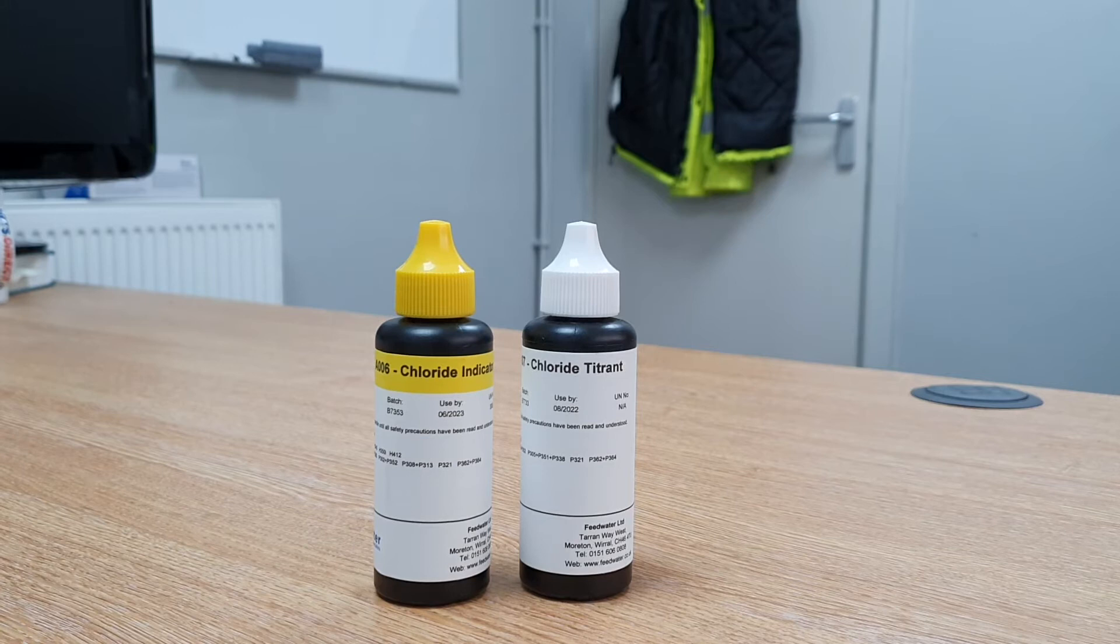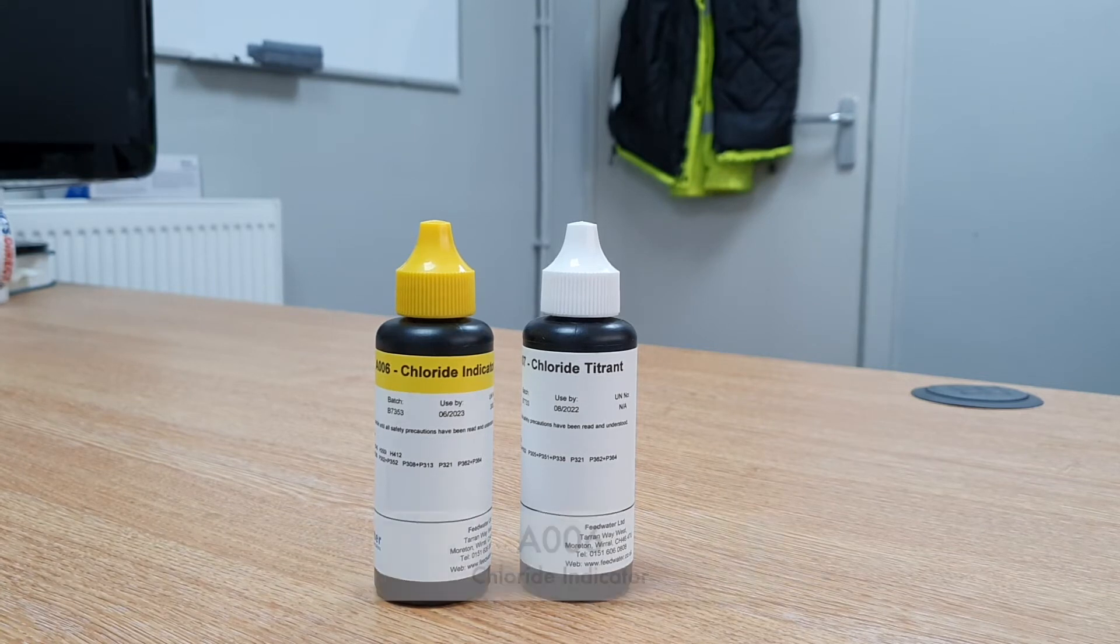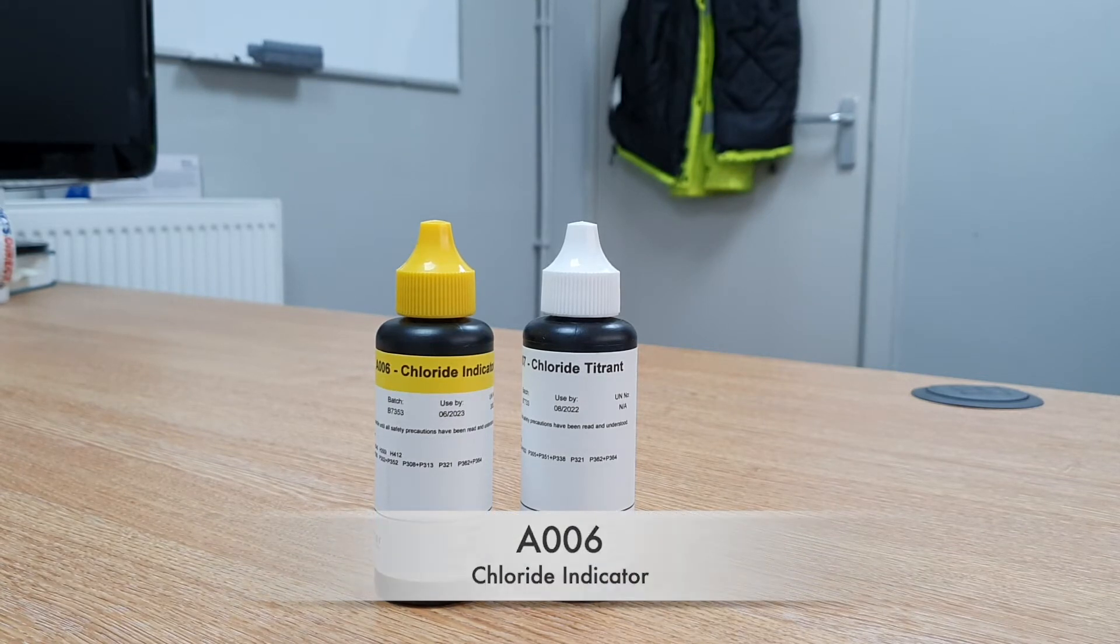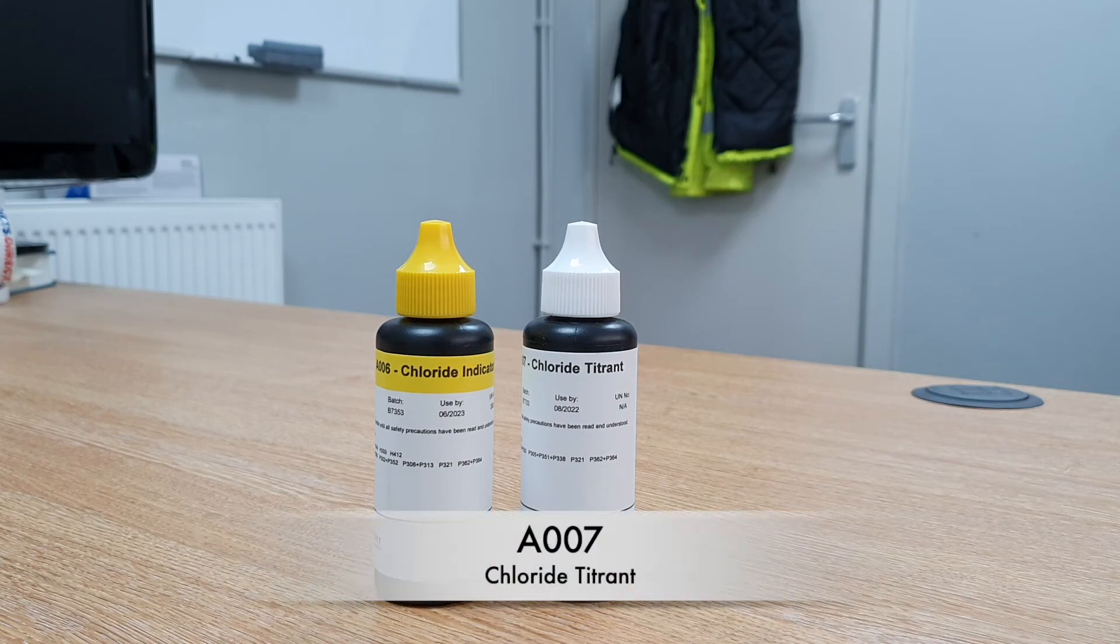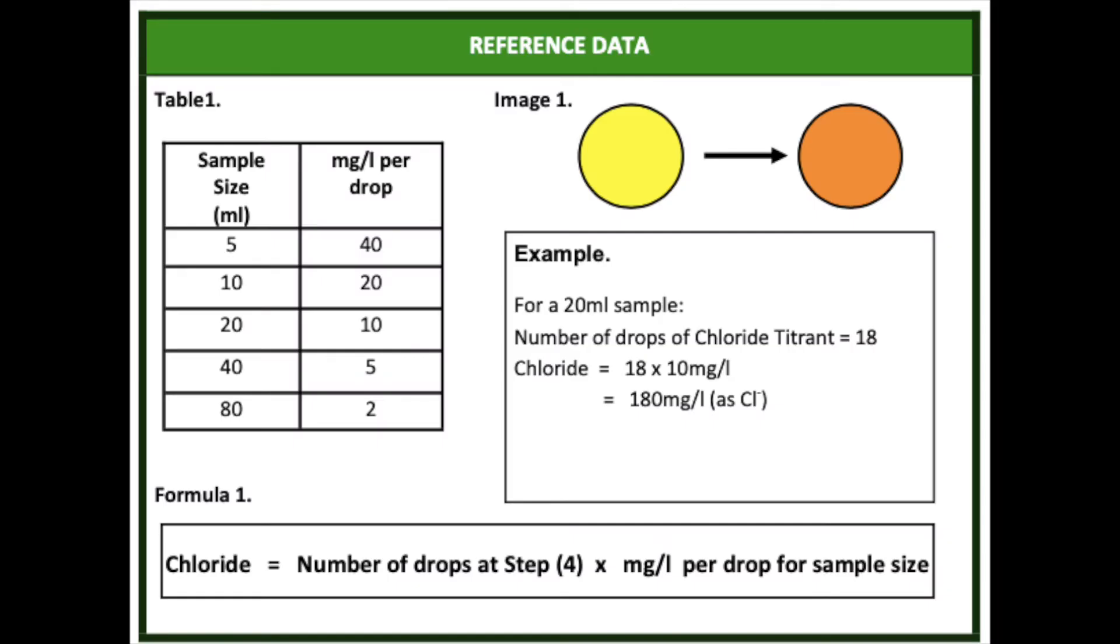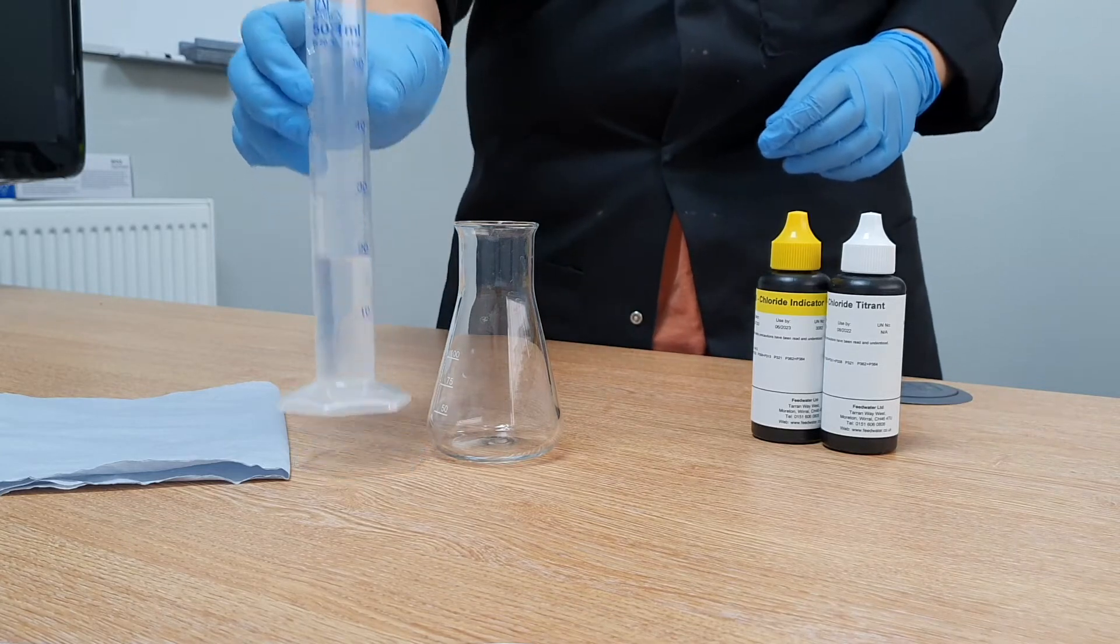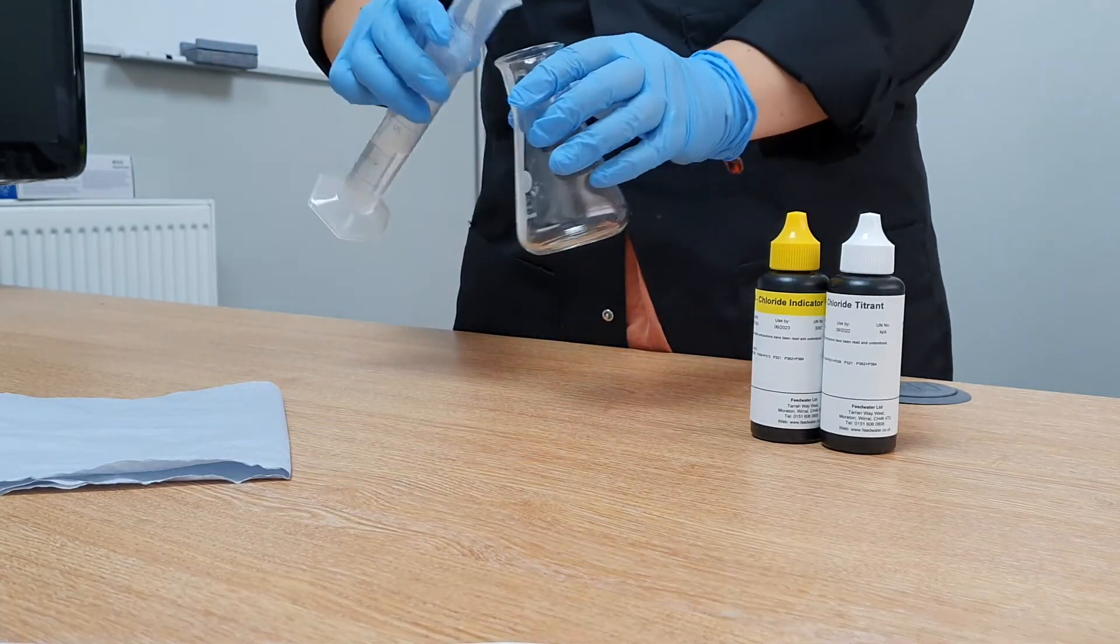For this test you will need the following reagents. Chloride indicator A006, Chloride titrant A007. Select an appropriate sample size based on the required mg per litre per drop of chloride indicator solution and filter the sample if necessary. In this demonstration we will be using a 20ml sample.